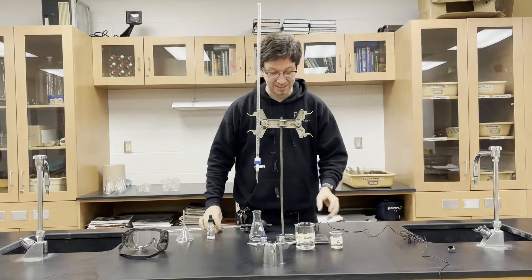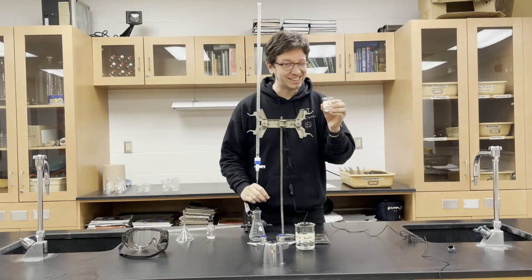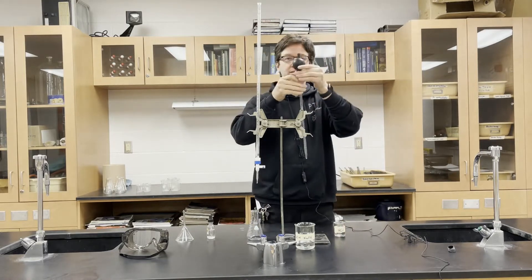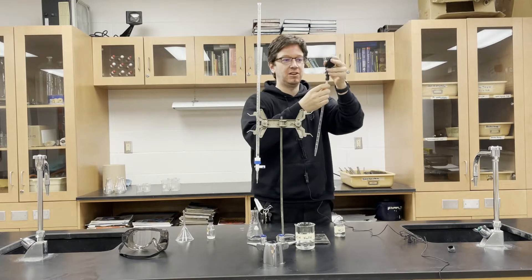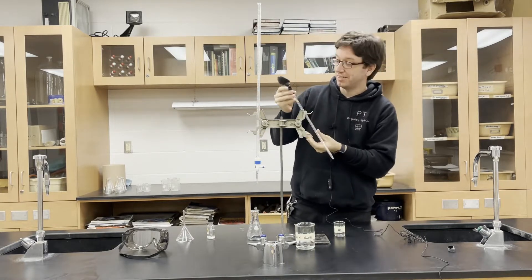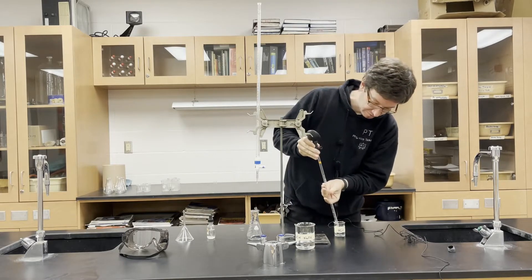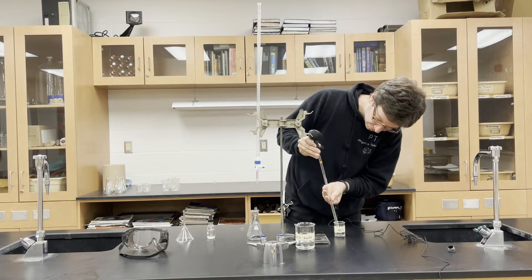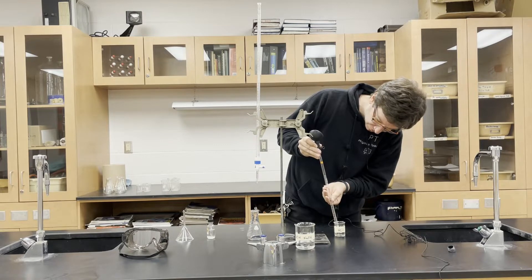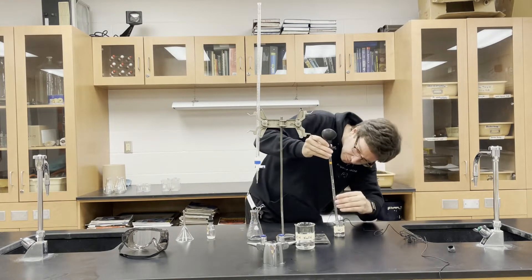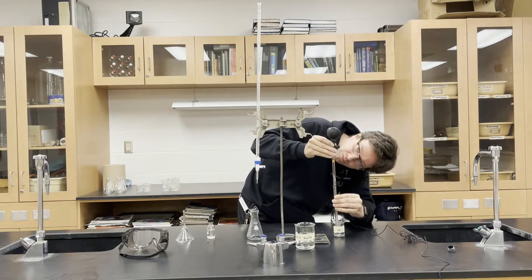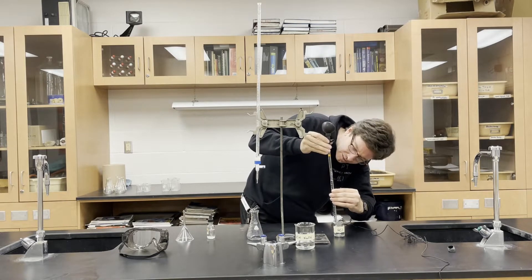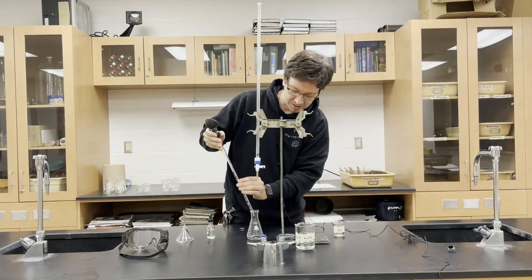The first step is to take our unknown hydrochloric acid and I want exactly 10 milliliters inside of our flask, so we're going to use the pipette. This is a 10 milliliter pipette. I got a little bit too much so I can expel a little bit. There's exactly 10 milliliters and I'll put it into our flask.